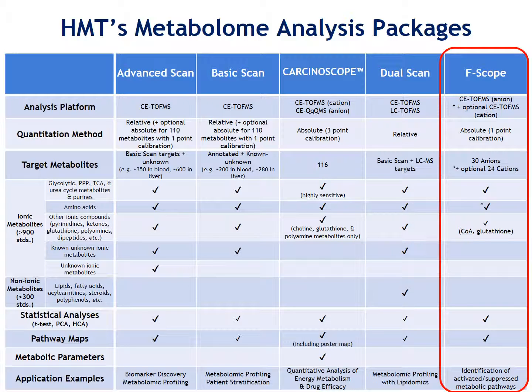For example, citrate can be formed from the traditional oxidative reactions of the TCA cycle. However, it can also be formed from a reversal of the TCA via reductive carboxylation. Unlabeled steady-state metabolomics cannot definitively determine the directionality of the TCA. However, by using uniformly 13C labeled glutamine, a clearer picture can emerge, as one carbon will be lost as CO2 via the oxidative pathway, while all 5 carbons will be retained via the reductive pathway. Therefore, analyzing the change in percentage of 4 or 5 labeled carbons in citrate can give clues to changes in the directionality of the TCA cycle.